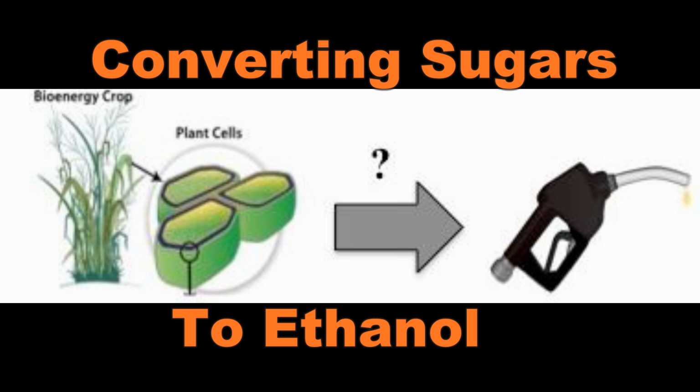Good morning. Welcome to the Converting Sugars to Ethanol video tutorial. This video will outline materials required and procedures to be followed when converting sugars to ethanol. First, let's start with some background.